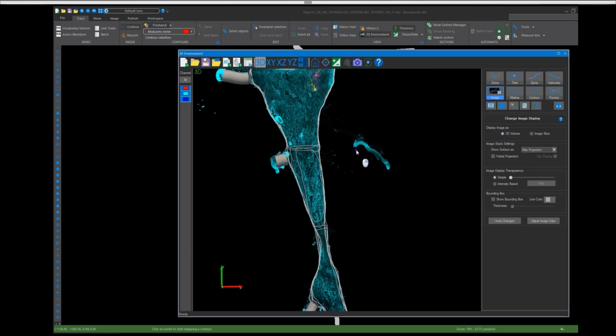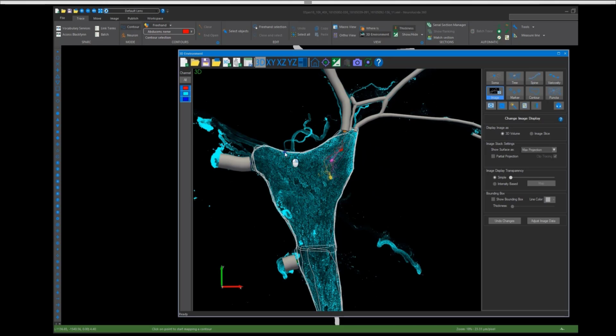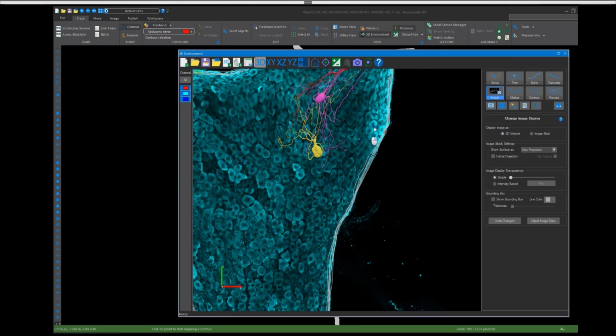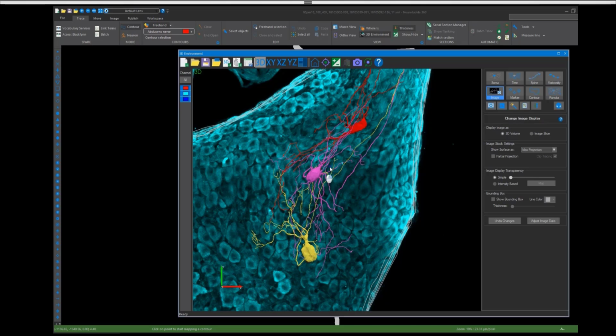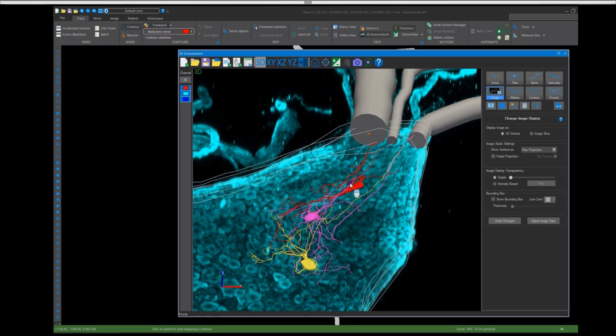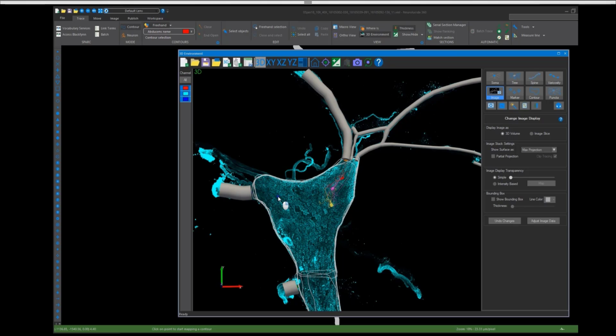We'll hit connect. We're going to now see in the 3D window the 3D image data of the whole stellate with the tracing data as well. Aiden explained how they use contours to contour the body of the stellate, and how they trace these high resolution cells in Neurolucida 360 and then merge them onto the 10x image data. They also traced the nerve bundles that enter and exit the stellate with the tree algorithms.